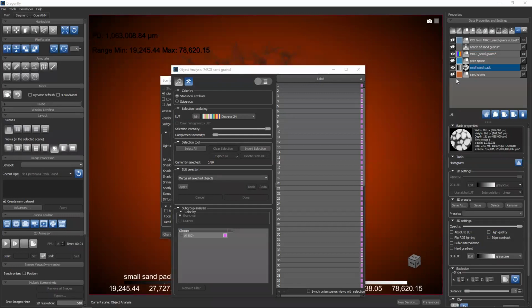Next question, could you please explain how we can import 3D fracture surfaces in the Dragonfly and convert them to condensed 3D solid? I don't know the question you're asking. If you mean, can we import a surface and convert to an image? Yes.